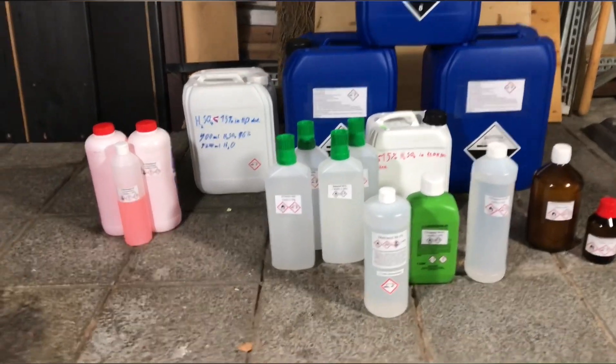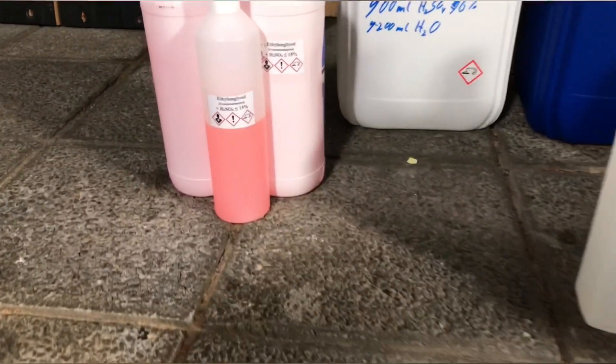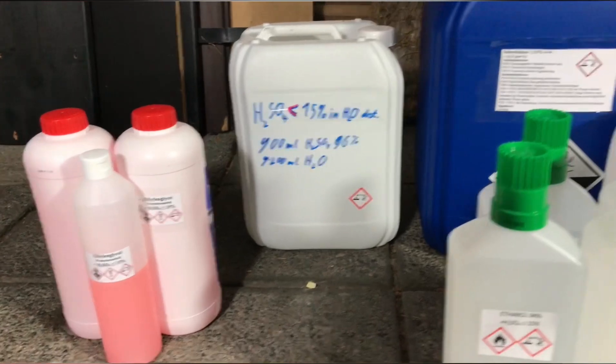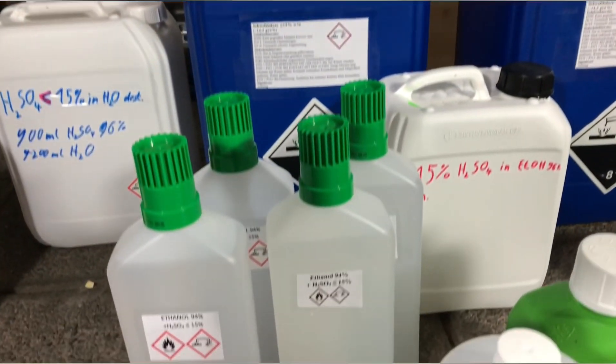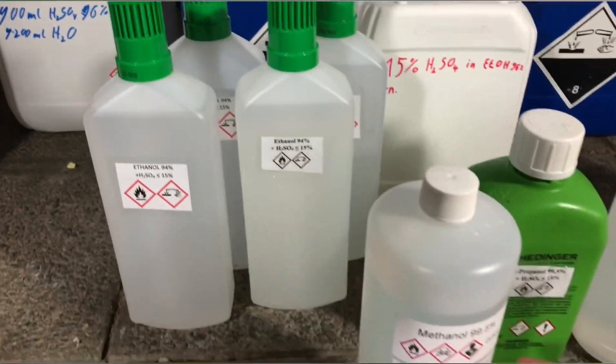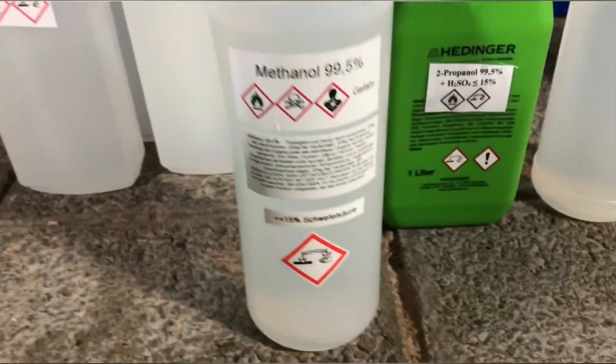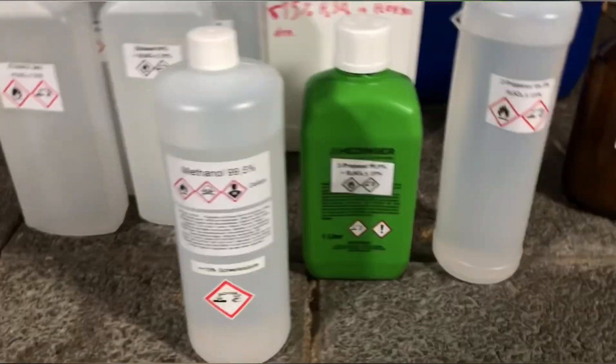And there you go, a lot of sulfuric acid diluted down to below 15% in many different mediums. Here we have sulfuric acid in ethylene glycol or antifreeze, sulfuric acid in water, sulfuric acid in ethanol, sulfuric acid in methanol, and sulfuric acid in isopropanol.